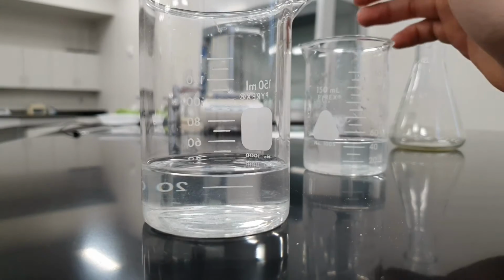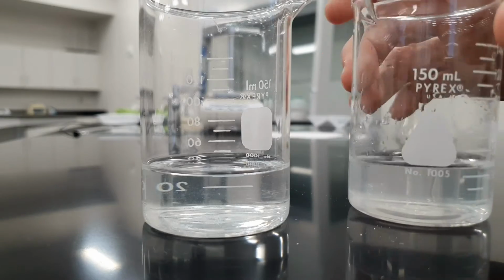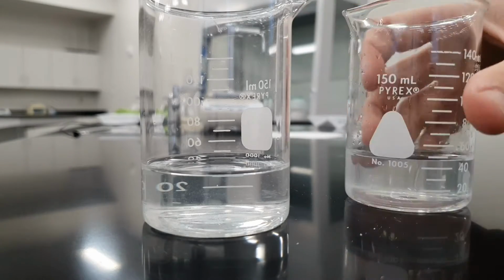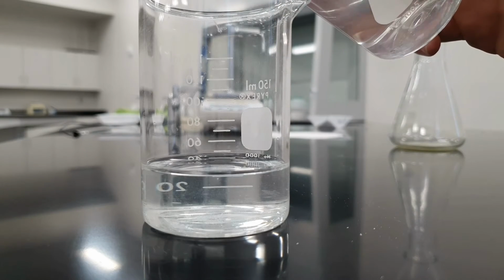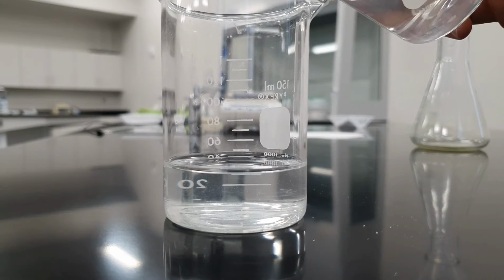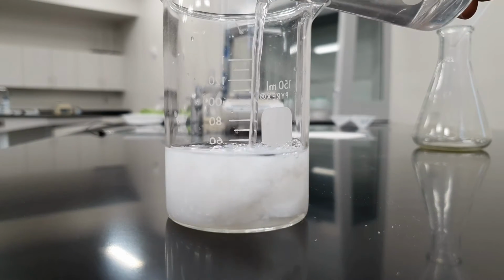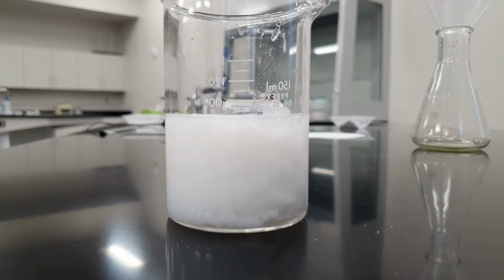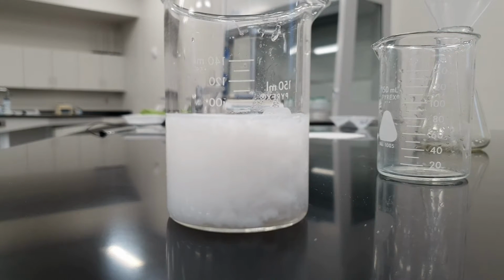All right, so we are ready for the next step. We're going to mix these two solutions together. So we've got two clear solutions. All right, we know what's in them. Those compounds have been dissolved, and let's go ahead and see what happens as I pour one into the other here. Let's see if there's any kind of chemical reaction that occurs. All right. So let's zoom into that a little bit. Let's see what we think here.